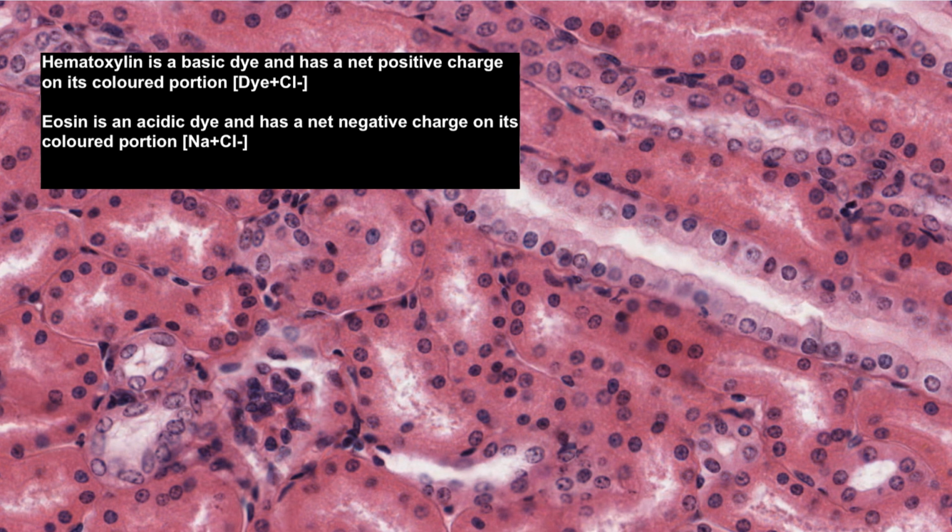When you use hematoxylin and eosin together, it stains different components different colours. Without going into the details yet, hematoxylin produces the purple or bluish stain you see associated with those components in the tissue we'll go through in a moment, whereas eosin stains the tissue components a pinky red colour. And that's what you'll commonly see in most of your slides in your class slide box if you're completing a histology practical class.